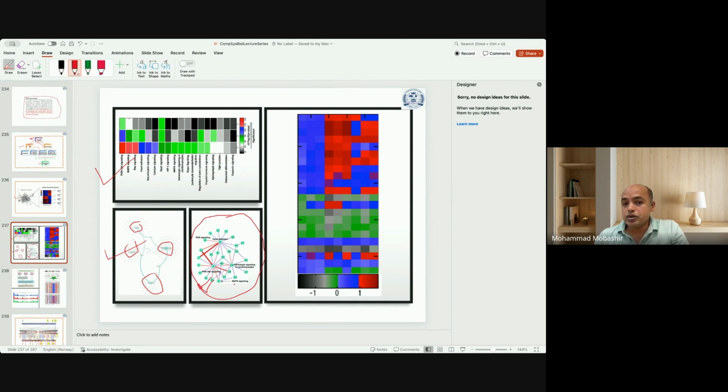And this is really very good software and much better than the software which is commonly used these days, which is really paid software. So this is free software, and the other software in use is only better in terms of easy handling and graphical presentation. But if you are slightly interested in the command line, then this software is really powerful and highly advanced. And this is real prediction of pathway crosstalk.